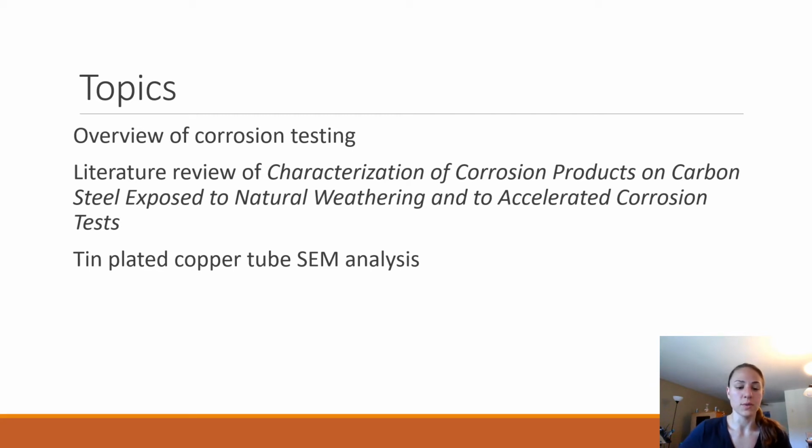The study was aiming to figure out how well these two test parameters are correlated, the test parameters being natural weathering versus the accelerated corrosion test done in a lab. And then I'll be discussing some analysis that I did at Modine Manufacturing. These were done on tin-plated copper hairpins, and I'll just be discussing some of the SEM analysis that we did.